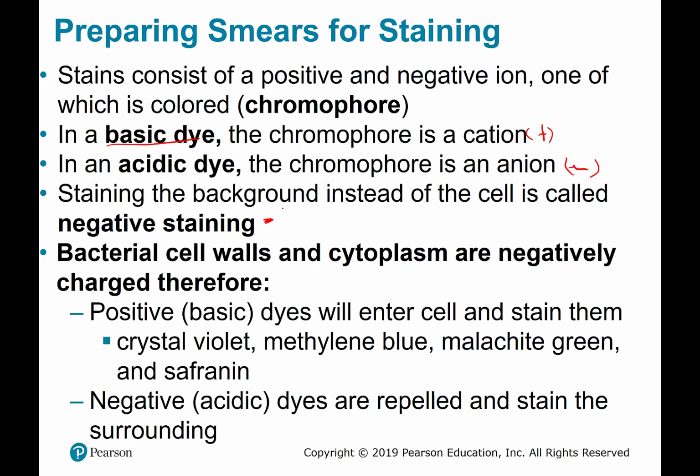And to understand how the dye works, you have to understand the bacterial cell wall as well as the cytoplasm. The cell wall and the cytoplasm have an overall negative charge. With the cytoplasm, you're talking about things like DNA, which has a negative charge, and molecules on the cell wall will have a negative charge. And so if you apply a positive or basic dye to that bacterial cell, that dye is going to be attracted, since it's positively charged. Remember, a positive charge is attracted to a negative charge.